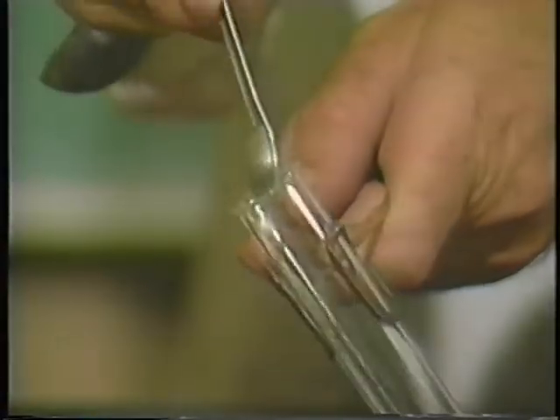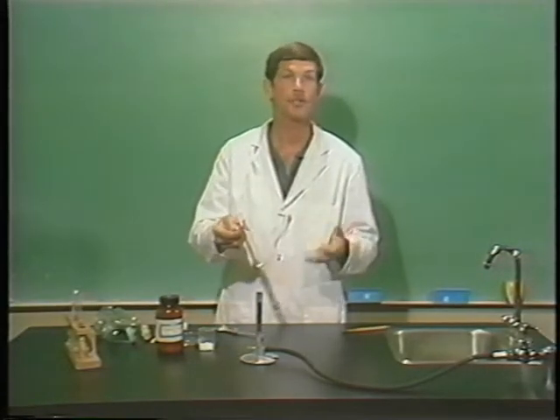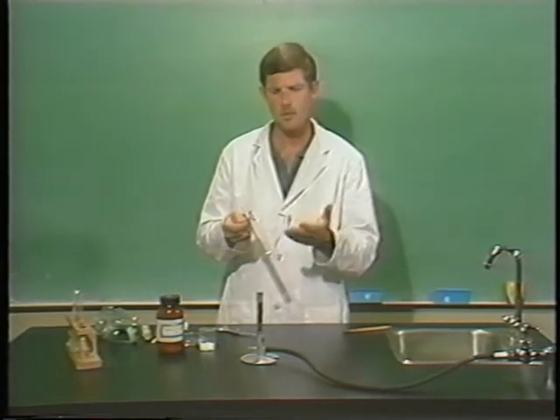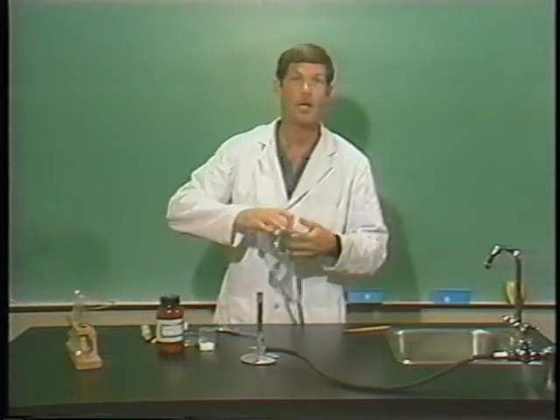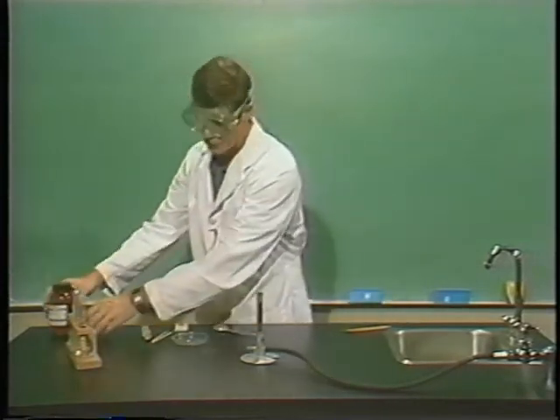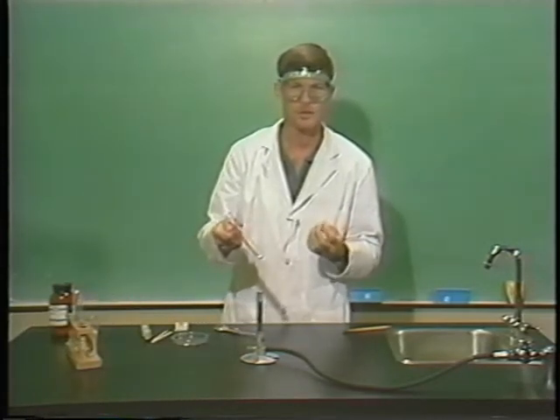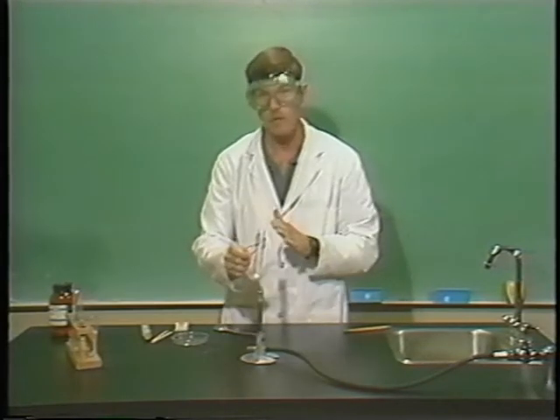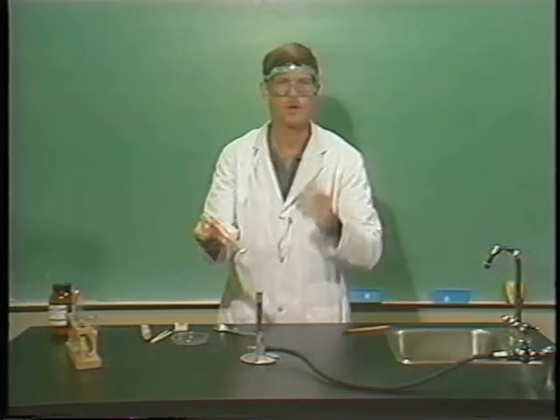Instruction number 2 might say, gently heat this material over the flame until it just melts, and then let it cool back down until it solidifies again. Since we're working with fire and chemicals, we definitely should have our safety goggles on in this experiment, and also it's very important to move all the major supply of chemical well out of the way of the flame. And when they say heat gently, they mean just move it in and out of the flame a little bit. Don't just hold it under the flame. And never, ever point a test tube at yourself or at anyone else in the classroom. It's always good to keep it at an angle and point it away from all people.